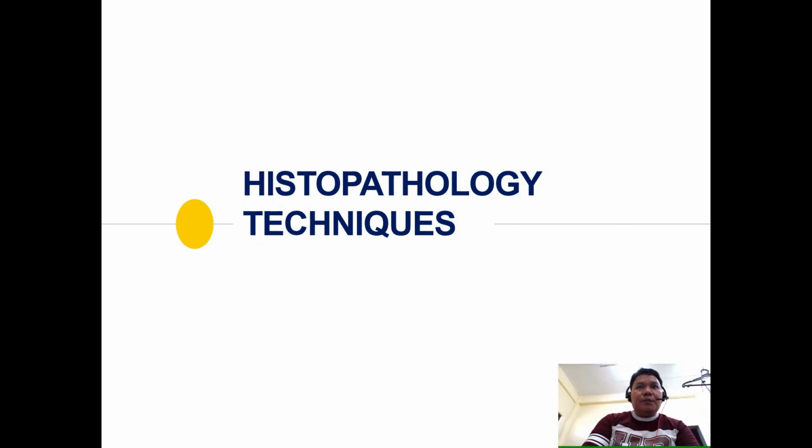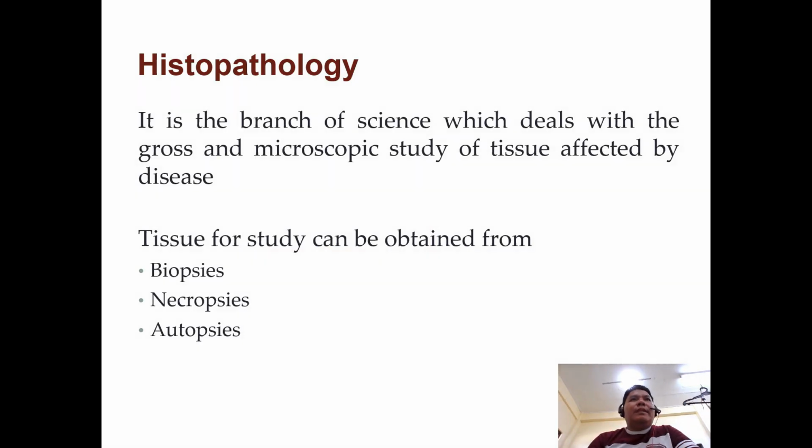Good day, everyone. For our exercise number 3, the topic is histopathologic techniques. So, what is the importance of histopathology?